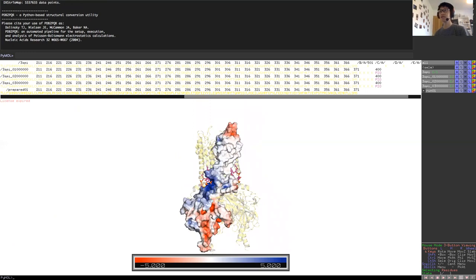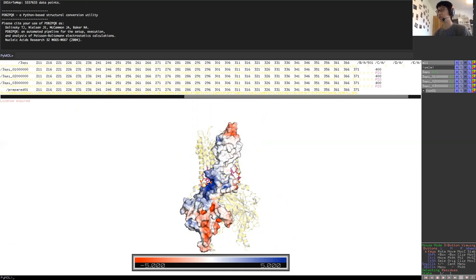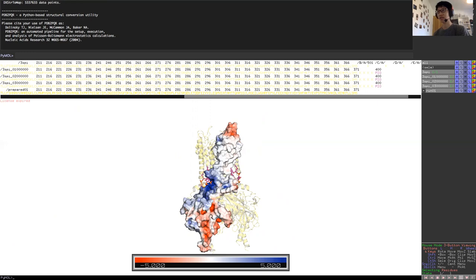So it's very interesting to use these tools to explore a property of a static structure of a molecule in a very quick assessment of what structure is going to look like and what properties they're going to have. Thank you very much.